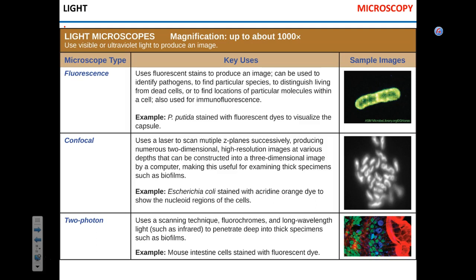This one will be probably about $4,000 because it has phase contrast capacity. Fluorescent microscopes you can buy used for about $10,000. New will be $20,000, $30,000. Okay, so what do they do? They have a UV light that lights up the specimen, and in response to that UV light, you know the black light?